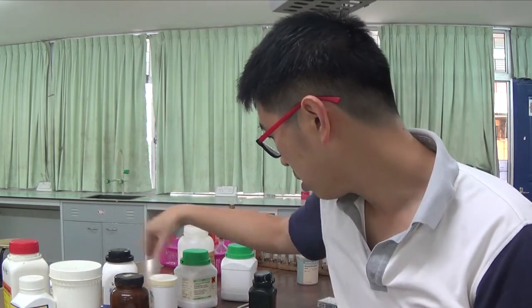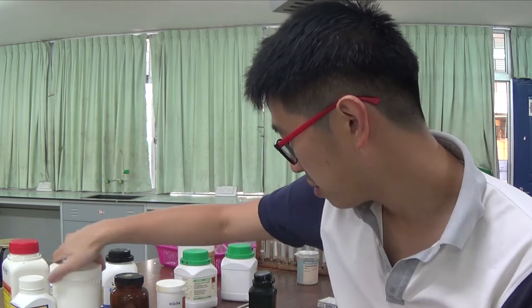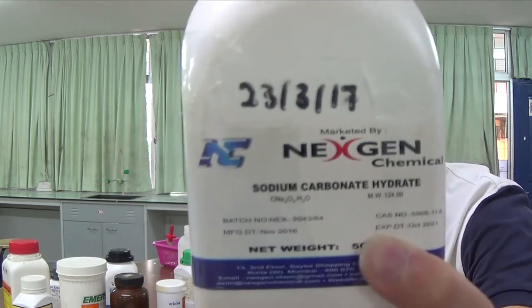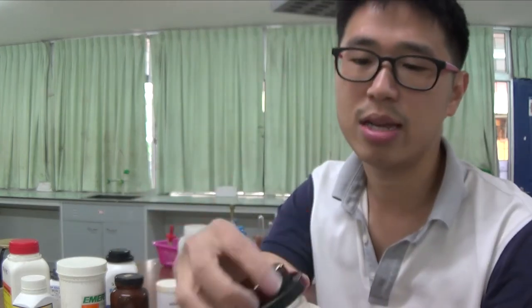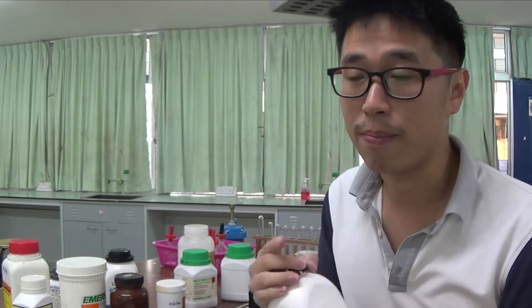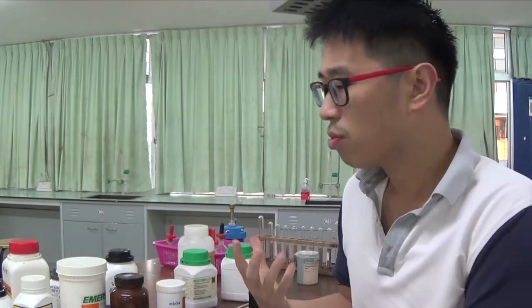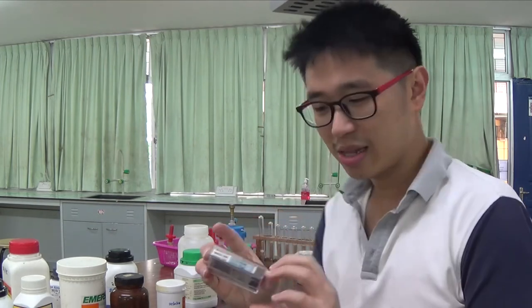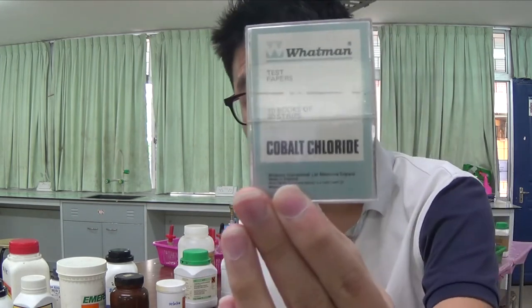Okay, this was the sodium carbonate that I had just now. So this was the hydrated sodium carbonate that I showed you earlier. It is also white in color, and there are many other transition metal compounds that are colored. So what's the reason for me working with these hydrated compounds? It's because there's a test for water.